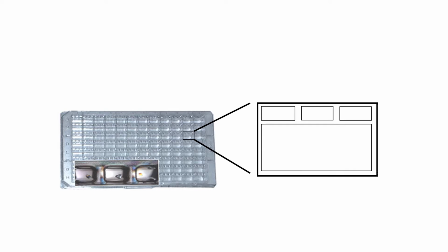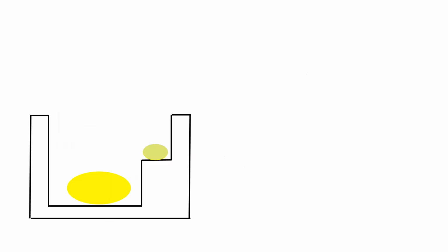Basically, we need a plate like this one, which can be 24 wells or 96 wells. Each well has a reservoir where you can add a certain amount of crystallization buffer and 3 other smaller reservoirs to put the sample mixture with crystallization buffer. Once adding all the components, it is essential to seal each well properly.